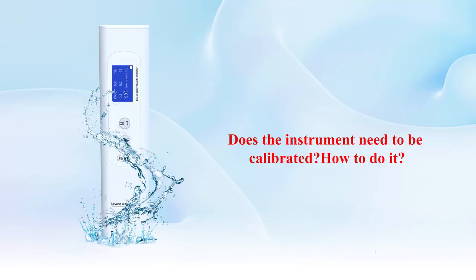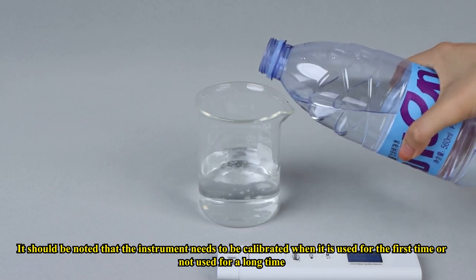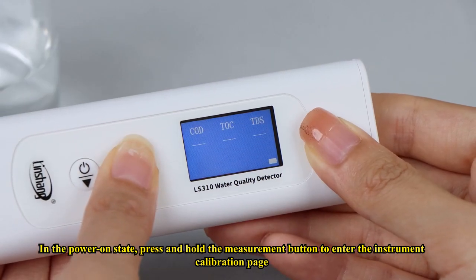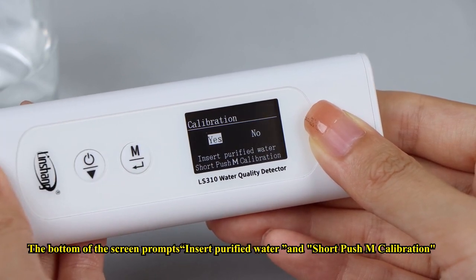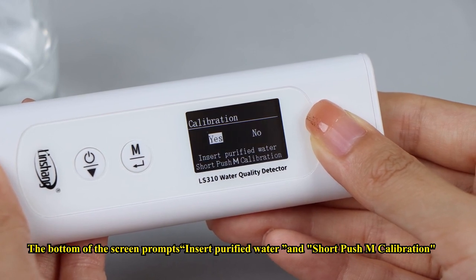Does the instrument need to be calibrated? It should be noted that the instrument needs to be calibrated when it is used for the first time or has not been used for a long time. In the power-on state, press and hold the measurement button to enter the instrument calibration page and select yes. The bottom of the screen prompts: insert purified water and short-press M to calibrate.